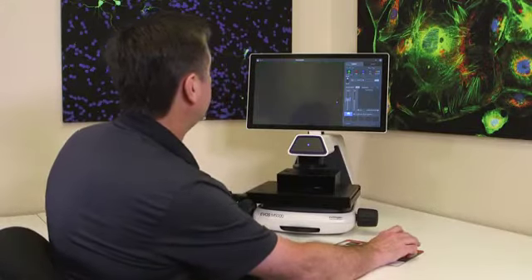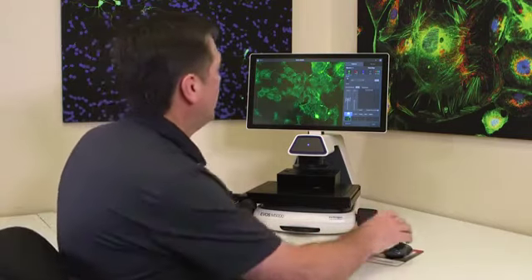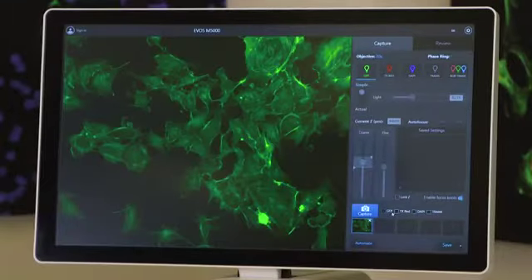In order to capture the other channels, I can do the same sort of thing in sequence and it will overlay, or I can actually ask it to collect the remaining 2 channels by selecting them in the software here and clicking capture, and it will go ahead and add those 2 to the image.